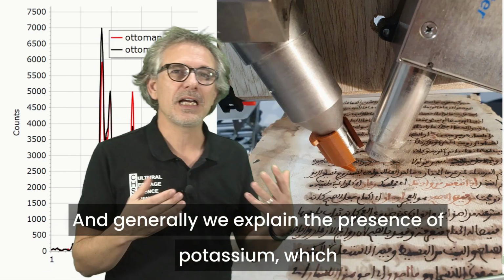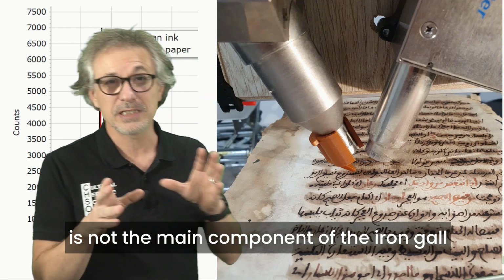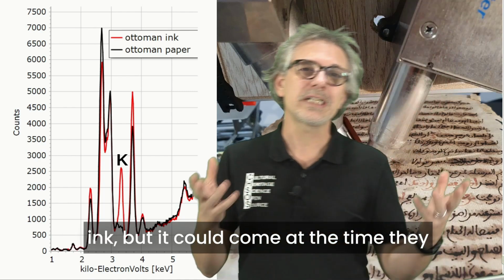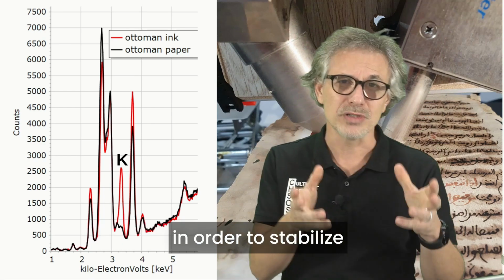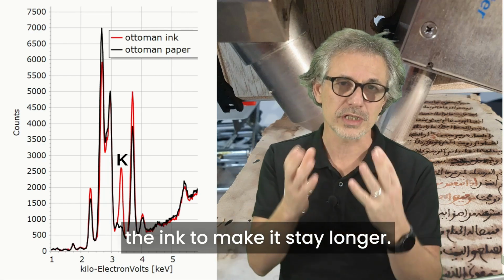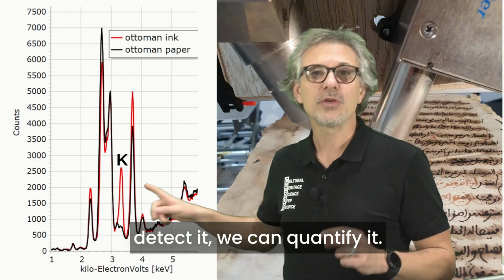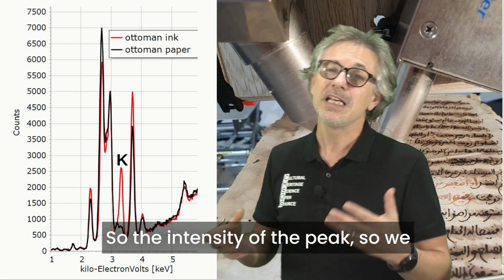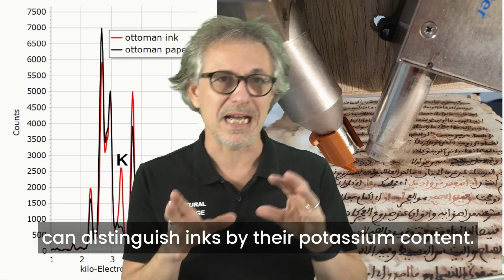And generally we explain the presence of potassium, which is not the main component of the iron gall ink, as coming from the time when they used potassium carbonate in order to stabilize the ink to make it stay longer. The important concept is that we can detect it, we can quantify it, so the intensity of the peak, so we can distinguish inks by their potassium content.